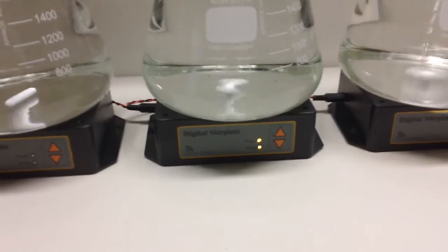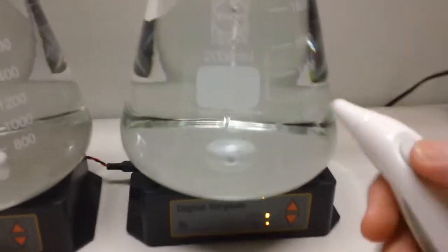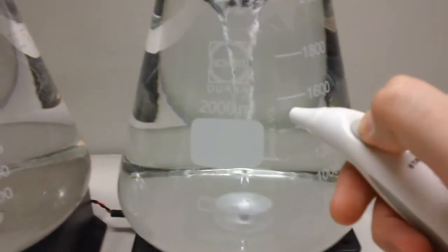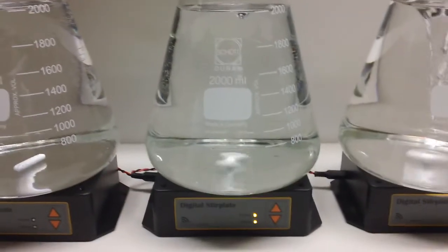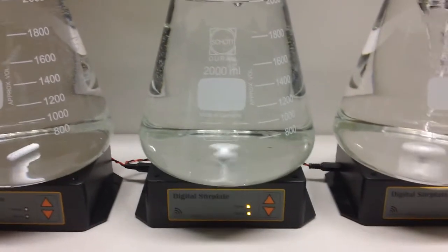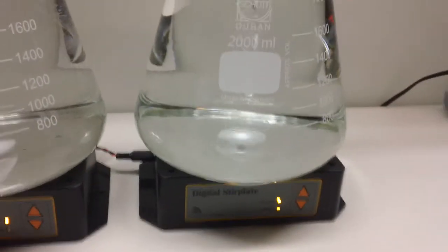And running at 1500 RPM will be hotter still. That's 28.9 degrees for a grand total of 1.6 degrees difference between having no stirring action whatsoever and stirring at 1500 RPM.